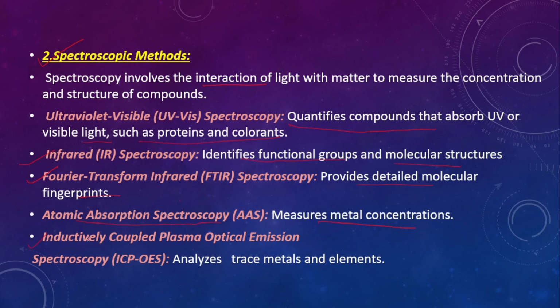Inductively coupled plasma optical emission spectroscopy analyzes trace metals and elements. It gives accurate determination of trace and ultra trace elements in food samples, detection of heavy metals and mineral content in food and water, and analysis of dietary supplements and fortification levels.